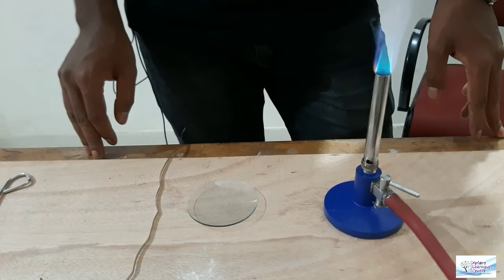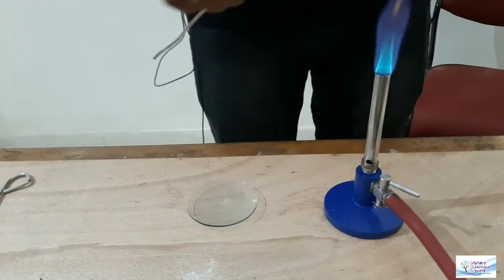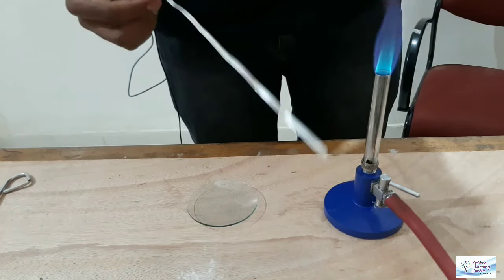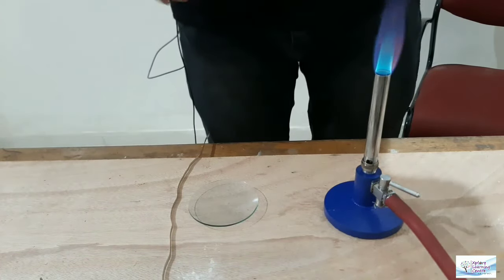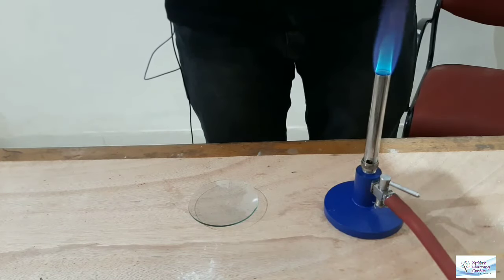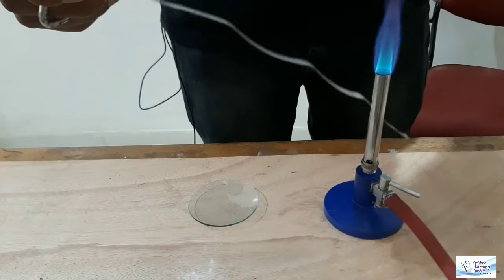We are performing activity 1.1. The apparatus required is a magnesium strip or magnesium ribbon, which is magnesium metal, a watch glass, and a burner. What we need to do for this activity is burn this magnesium ribbon on a flame and observe what happens.